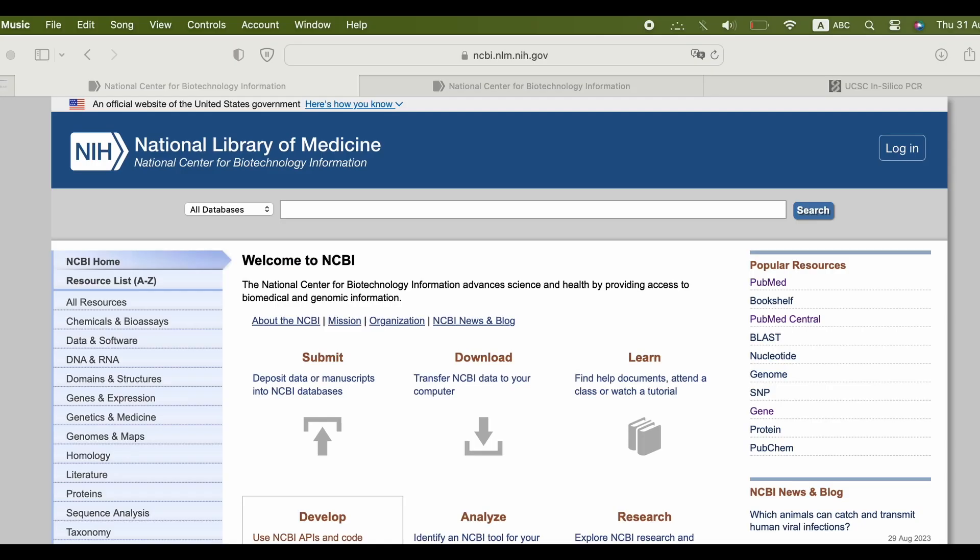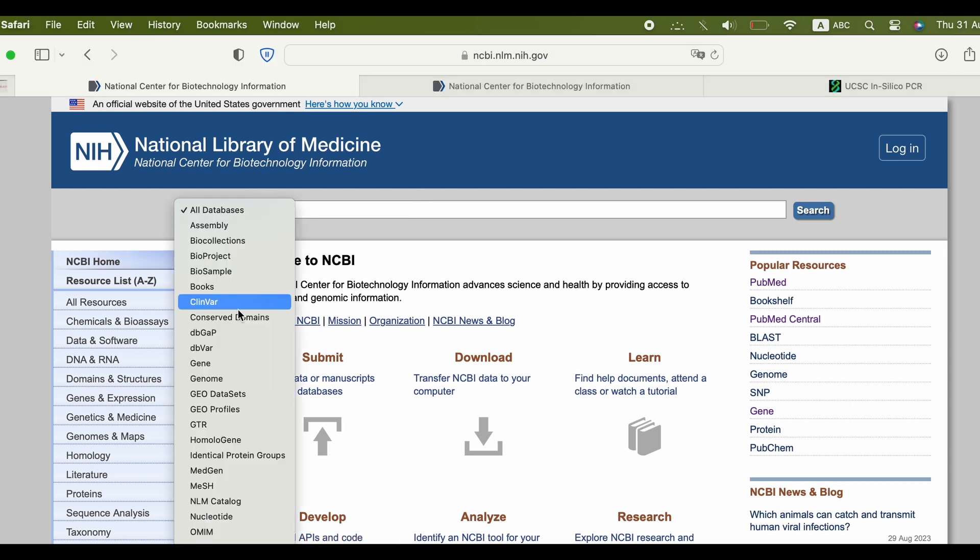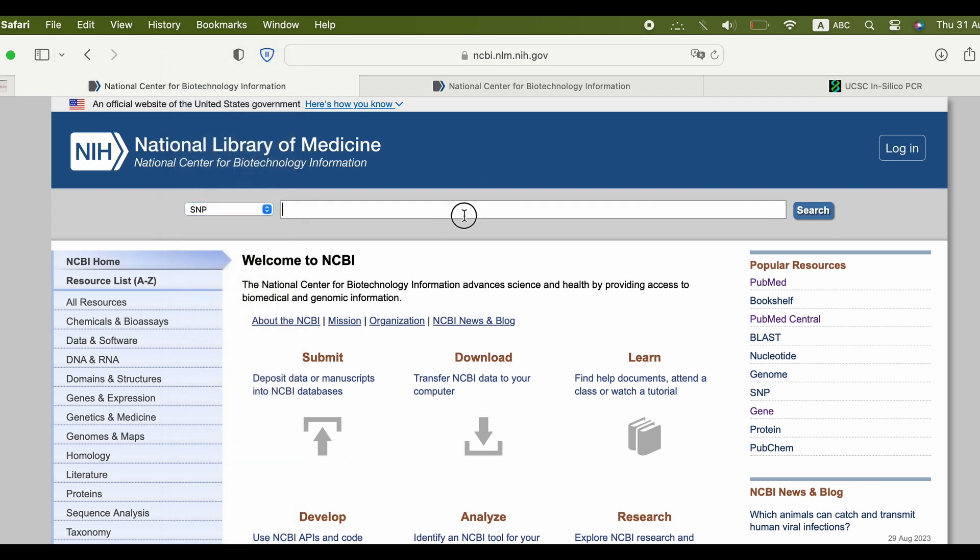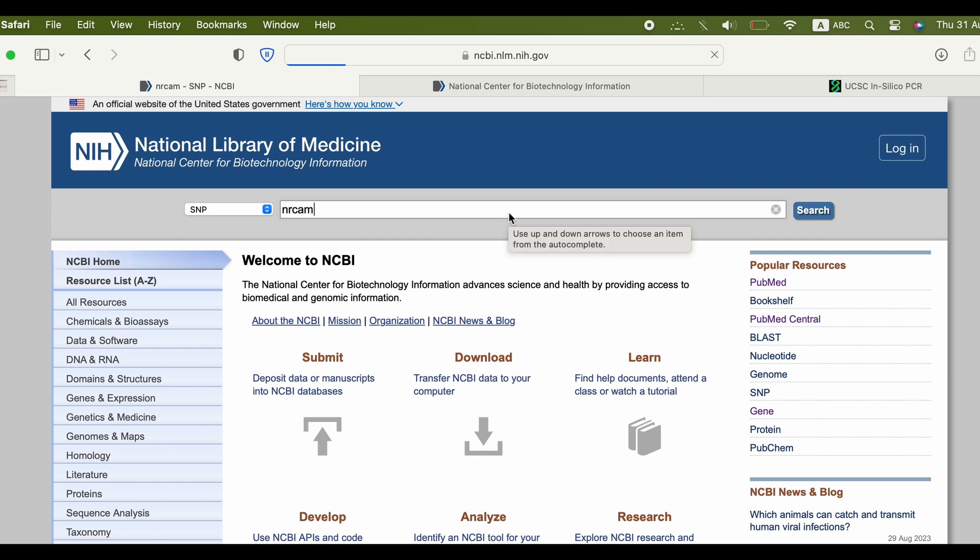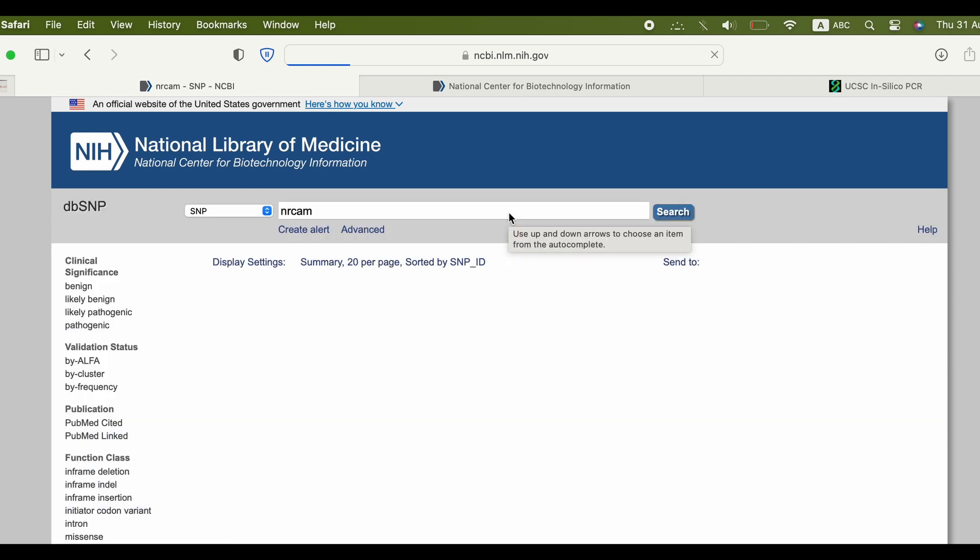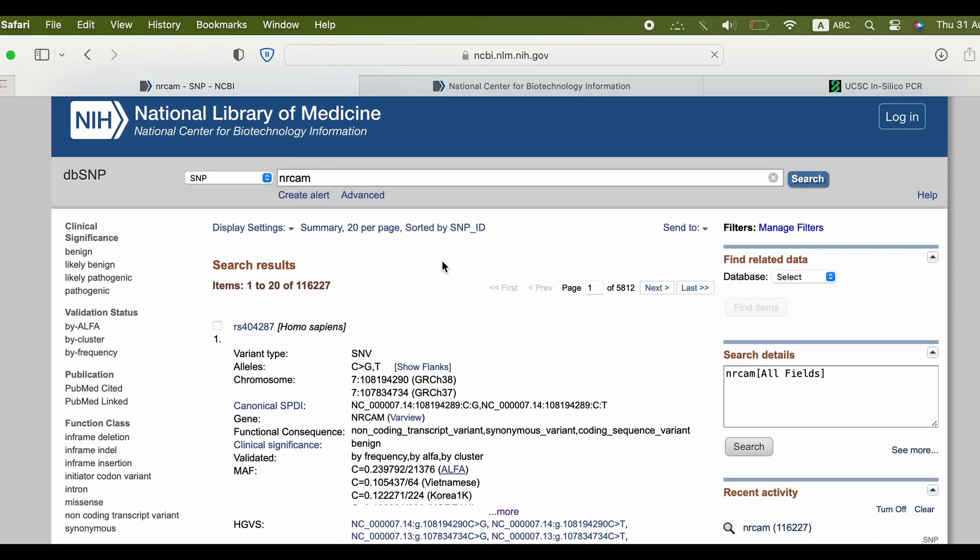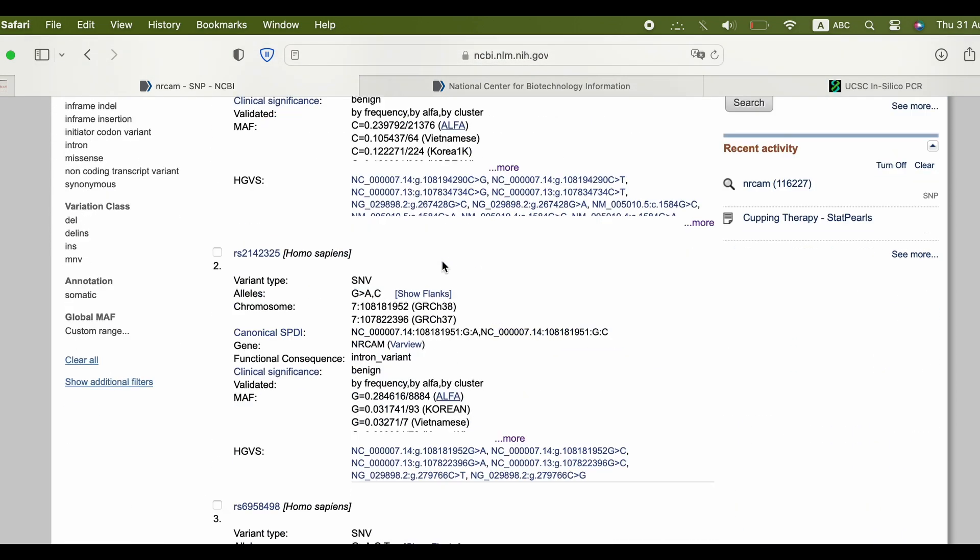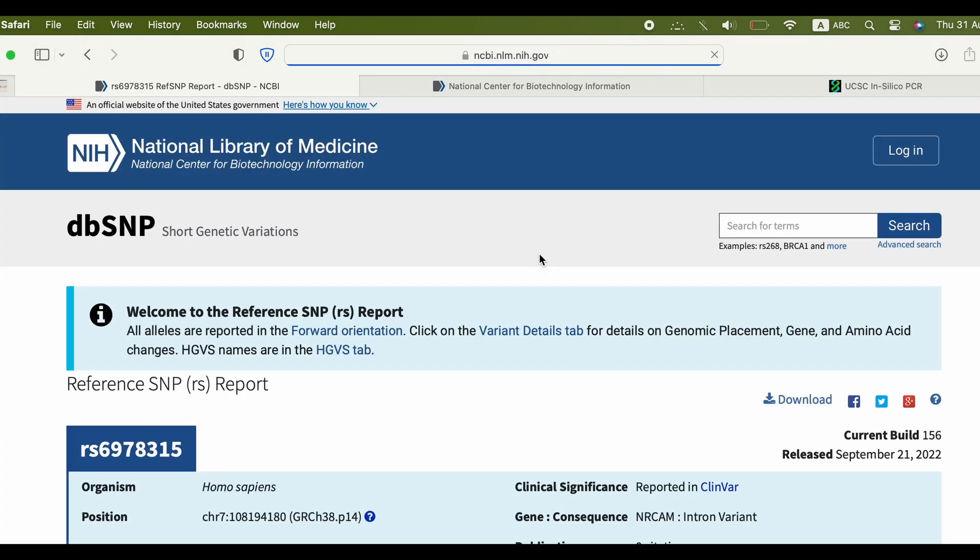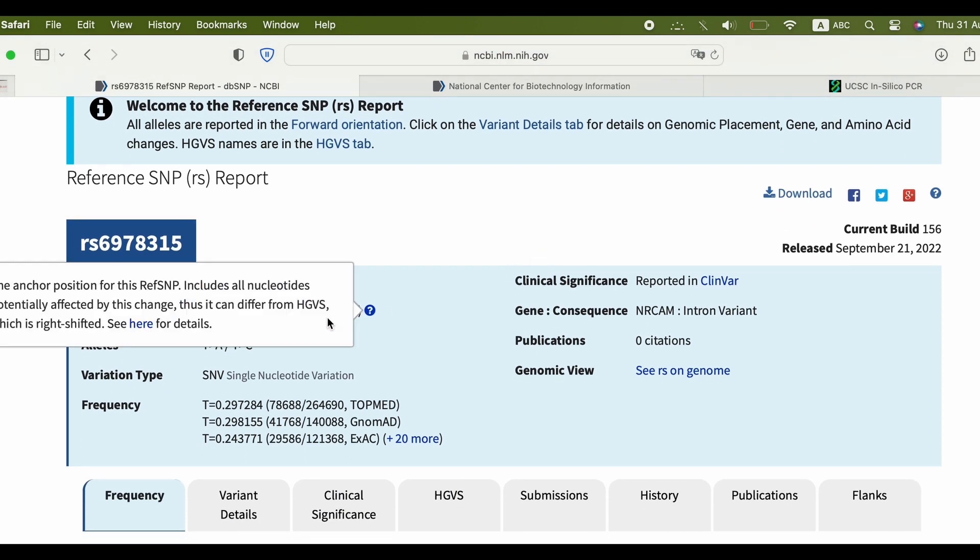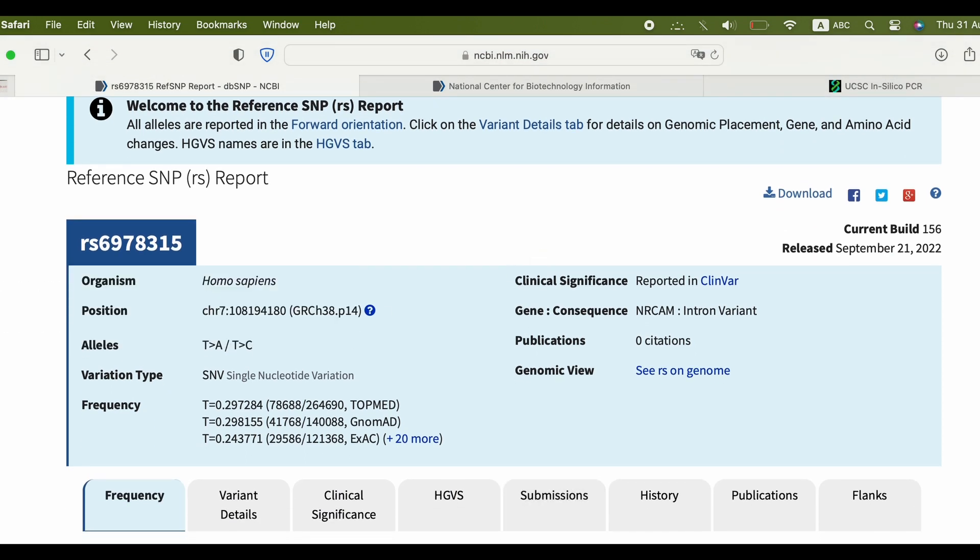First, go to NCBI website and select SNP and insert the name of the gene of your interest. Then select the SNP you want. The website offers a lot of useful information about the SNP. You can look at it.